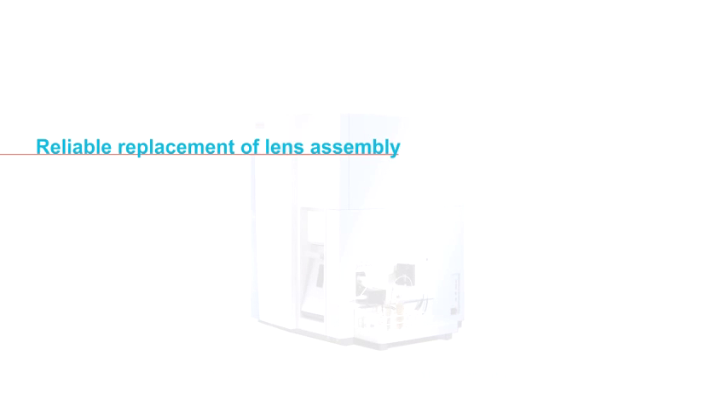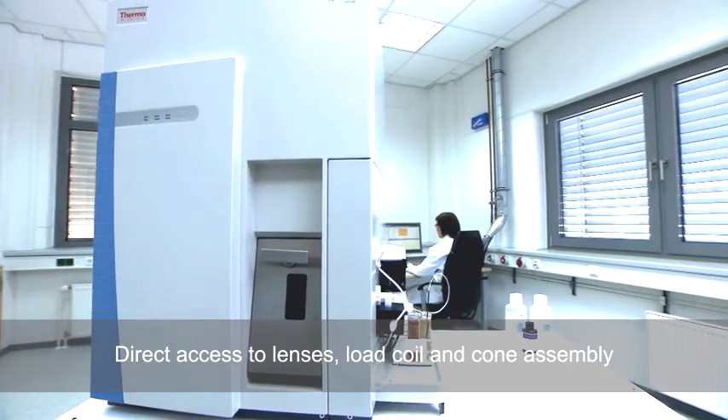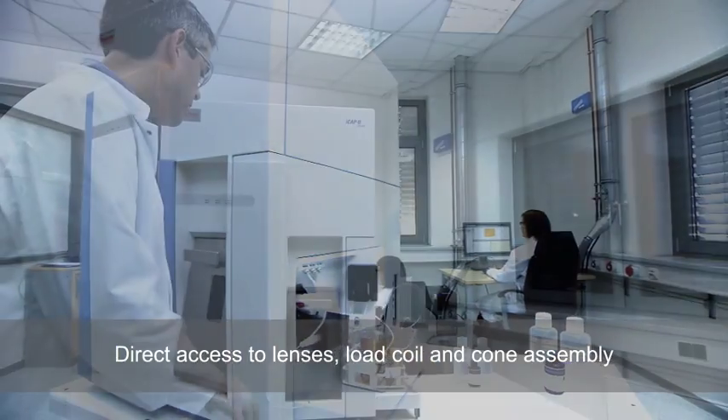Reliable replacement of lens assembly on the Thermo Scientific ICAP-Q ICP-MS. The innovative ICP-MS design provides direct access to lenses, load coil, and cone assembly.